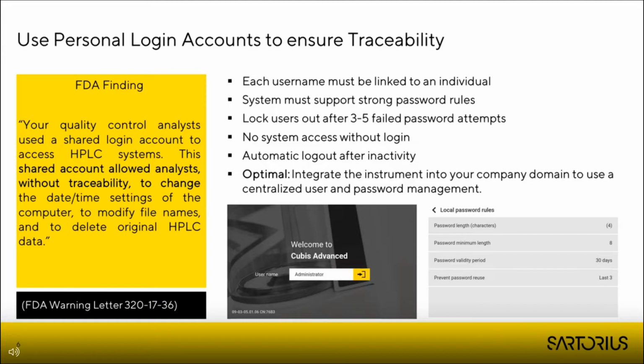And on the other hand, this user account should also be protected via a strong password for the authentication. And we recommend that this password should follow your company rules. So therefore, it should not be given by the device manufacturer. It should be possible to adapt these password rules to your company needs. Yeah, in an optimal case, you have an instrument integration into your company domain so that the user can use the same password as he typically uses to log on to Windows.